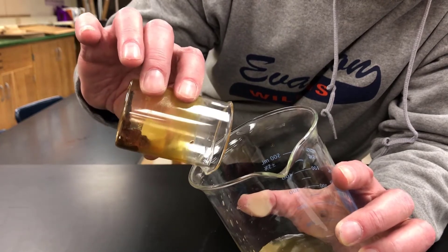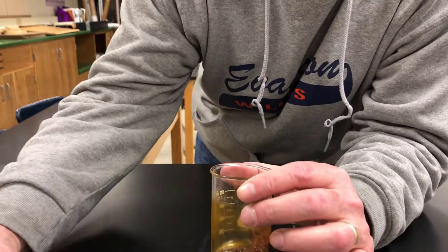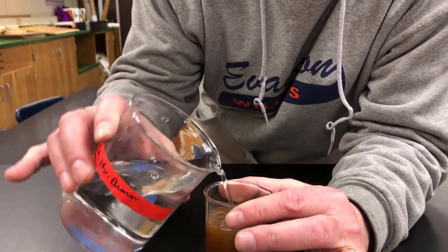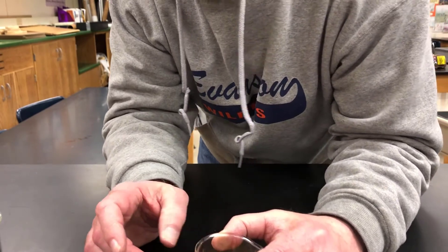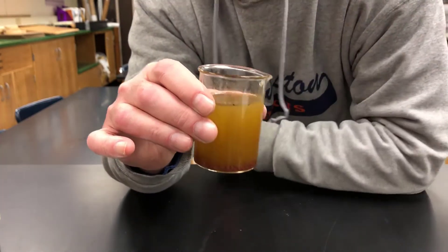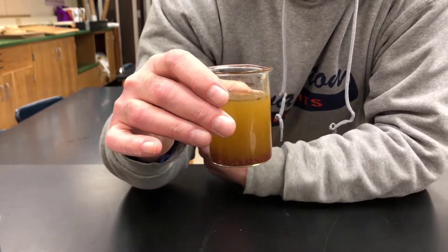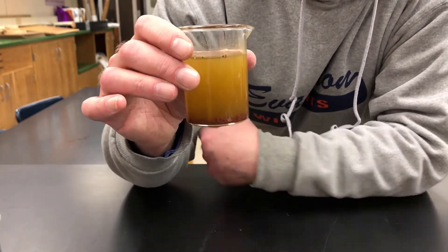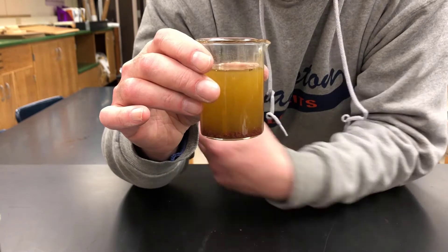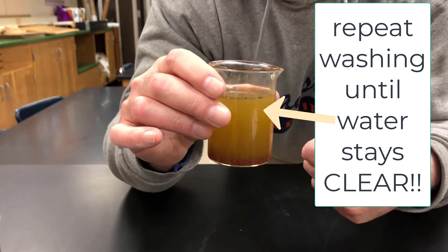Once you've poured off the majority of the liquid above the solid, you want to wash it — you don't want to work with contaminated material. Pour more water in, stir it so everything you want to get rid of is mixed into the water. Let it sit for a few minutes, make sure the particulate you want to save — in this case the reddish brown material — is completely settled at the bottom, then decant again. That is how you wash.